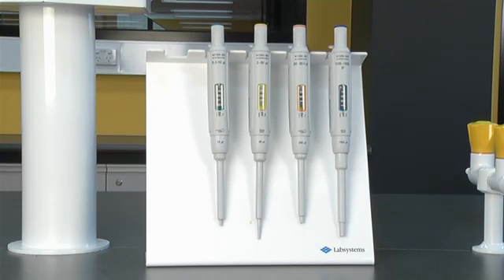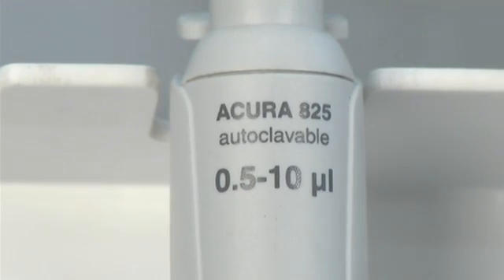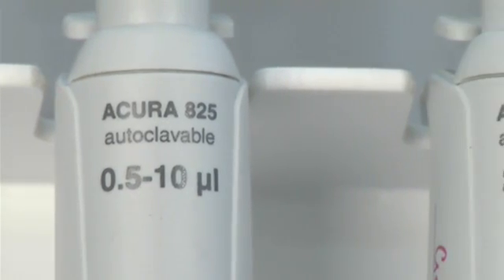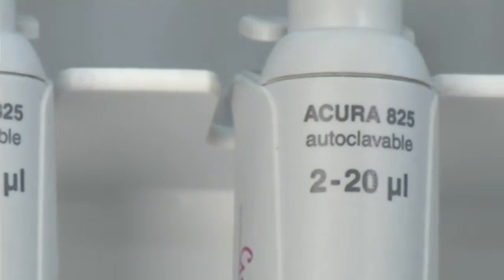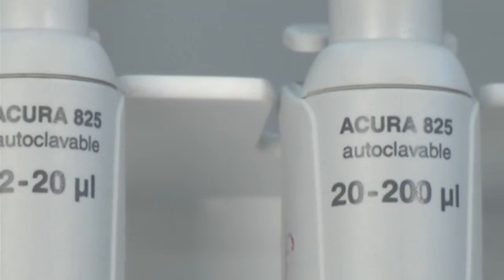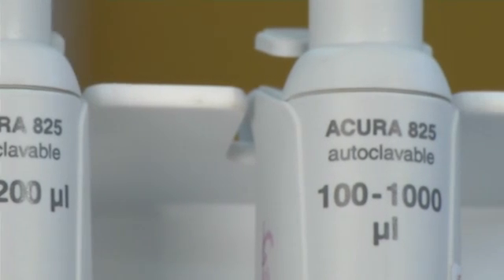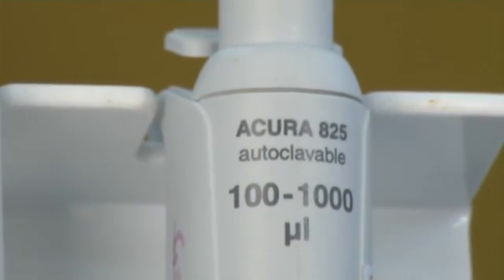Automatic pipettes are manufactured to cover a number of different volume ranges. Typically the pipettes you will use will be 0.5 to 10 microliters, 10 to 100 microliters, and 100 to 1000 microliters. They are normally referred to by the maximum volume they dispense, for instance 10 microliters, 100 microliters, or 1000 microliters pipettes.